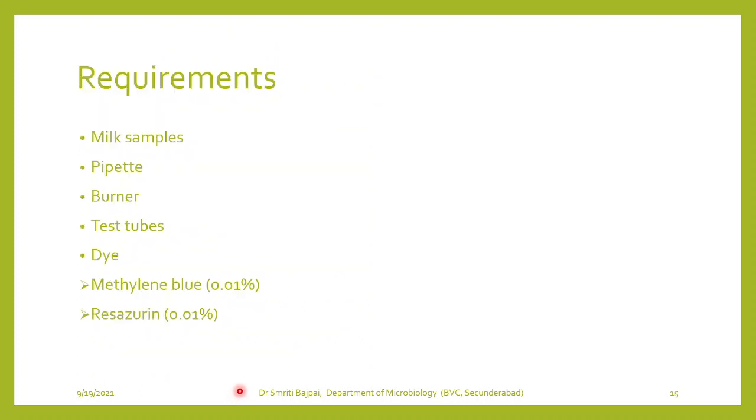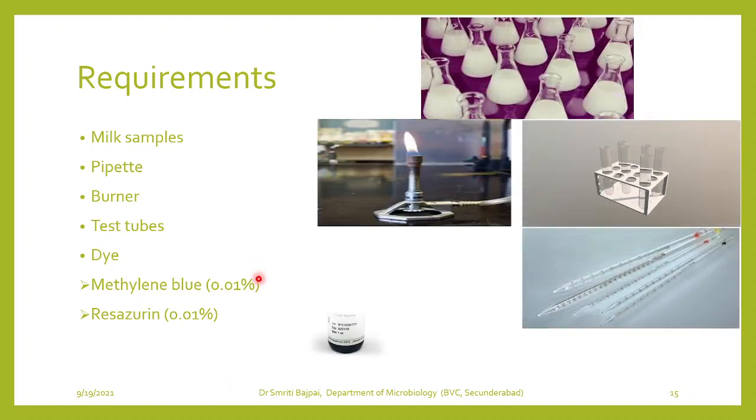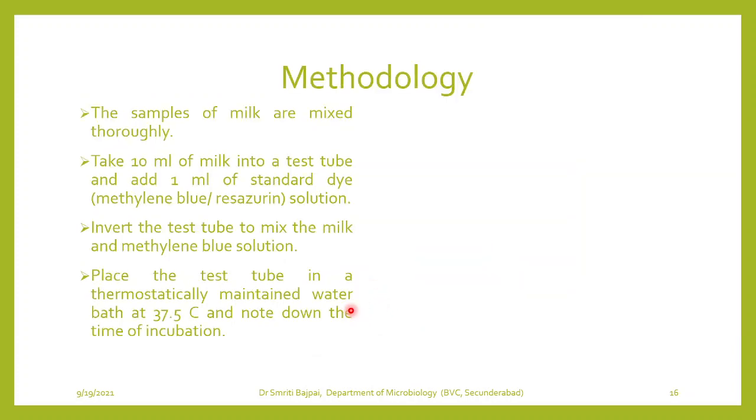Now this was the principle. Now the requirements for this experiment are the milk sample, pipette, burner, test tubes, and dyes. The dyes will be methylene blue and Resazurin. So these two reduction dyes we are going to check for this activity.